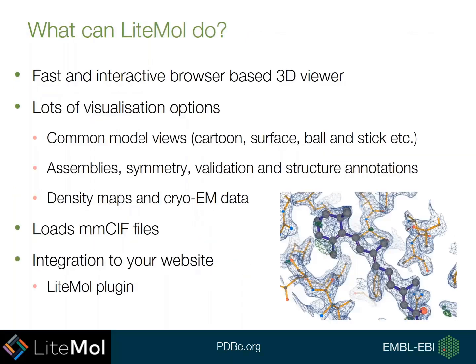So as I've said, LiteMol is fast, and it's also interactive, and you can use this within your browser very easily. There are a number of different options for visualization. You can view polymers in the common model views that you'd see in other visualization software. You can view it in cartoons, surface, ball and stick, and other modes like this.